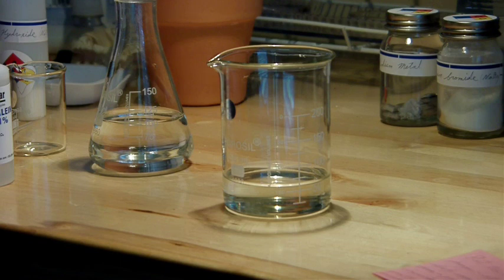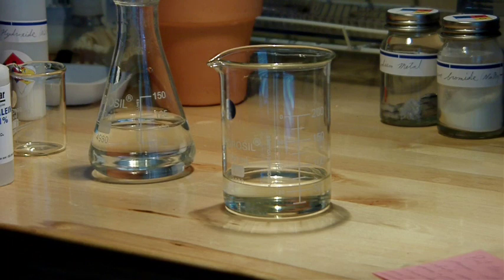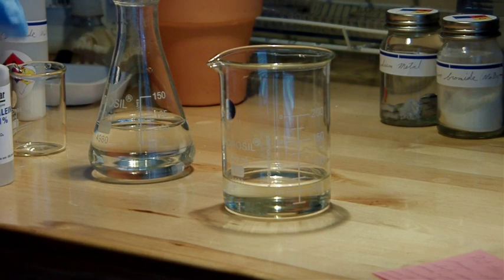So what I have in the beaker is 50 milliliters of the hydrochloric acid. And I'm going to titrate that against 100 milliliters of 5 molar sodium hydroxide solution.